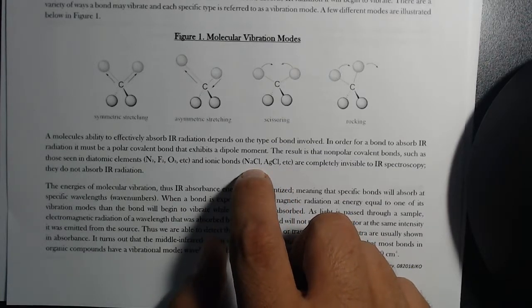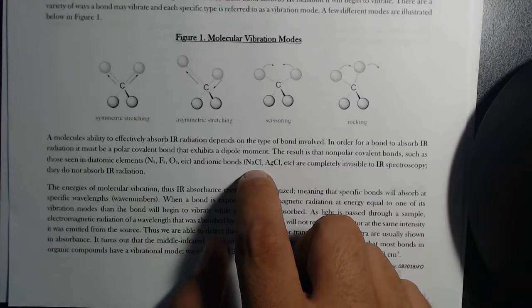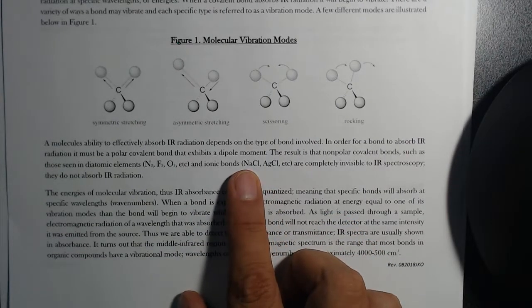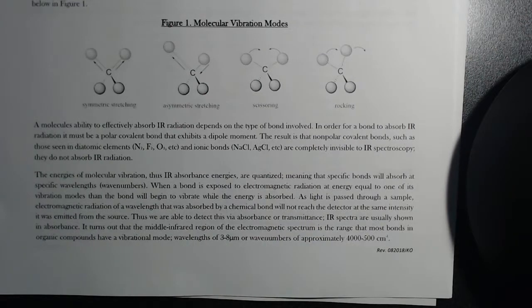When we get to lab this week, I know some of you have labs tonight, and some of you have it on Thursday. When you're done with your salt plate, should you throw it in the sink and wash it in soap and water? No. Sodium salts are soluble. These plates are rock salt that have been machined to be nice and smooth.